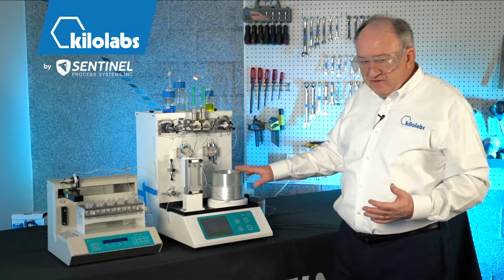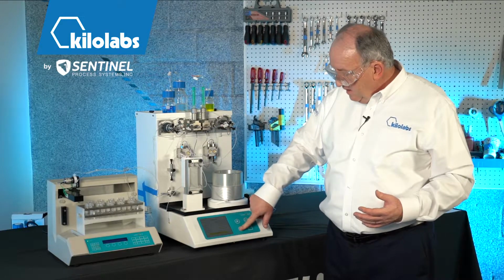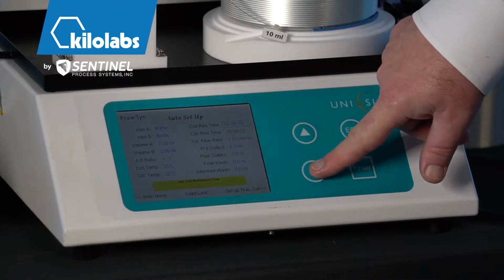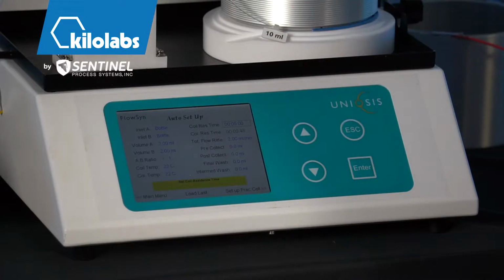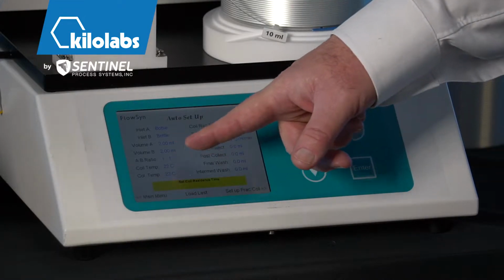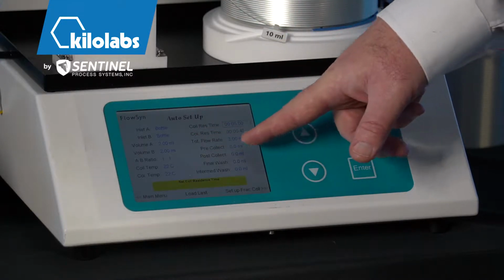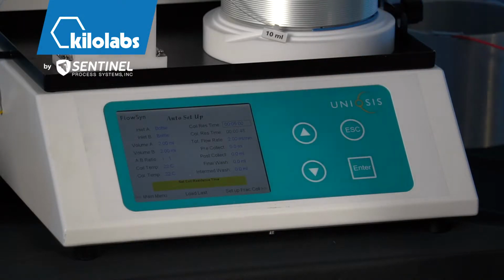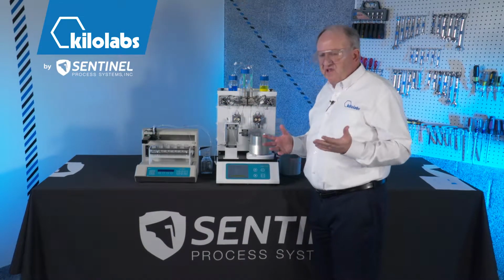This is the residence time attribute. The default is 10 minutes, but we don't want to spend 10 minutes doing that. So I'm going to set this back down to 5 minutes of residence time. And what you can see is when I change that, the total flow rate changes proportionately. So the total flow rate will be 2 ml per minute. This is also for the first experiment with a ratio of 1 to 1. So each one of these pumps is going to be putting out 1 ml per minute to get a total flow rate of 2 ml per minute and a residence time of 5 minutes. You don't have to worry about that for the purposes of this demonstration. What I'm saying is that the robot automatically calculates a lot of this for you.